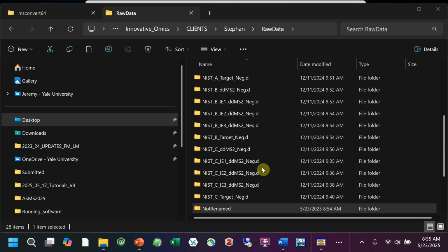Hello, this is Jeremy Comel, Research Associate Faculty at Yale University and CEO of Innovative Omics, and today we're going to be discussing how to rename your files for the correct conventions for LipidMatch, FluoroMatch, PolyMatch, etc., all of our software platforms.